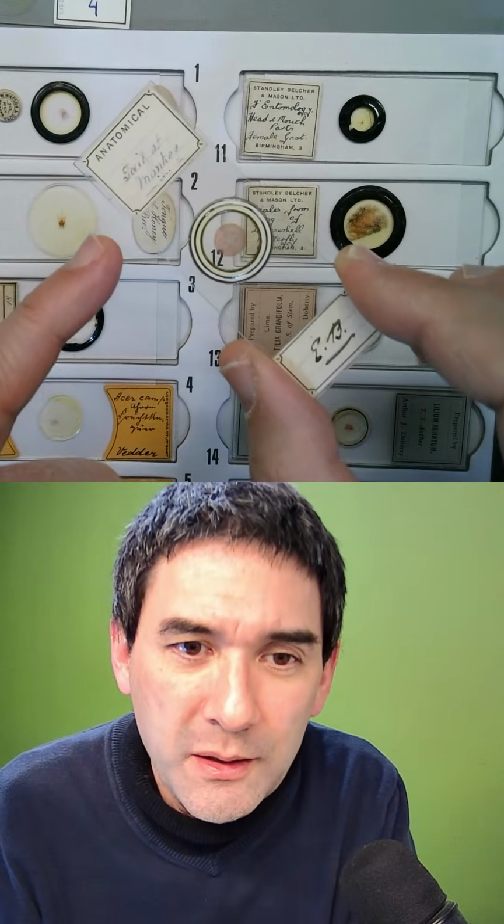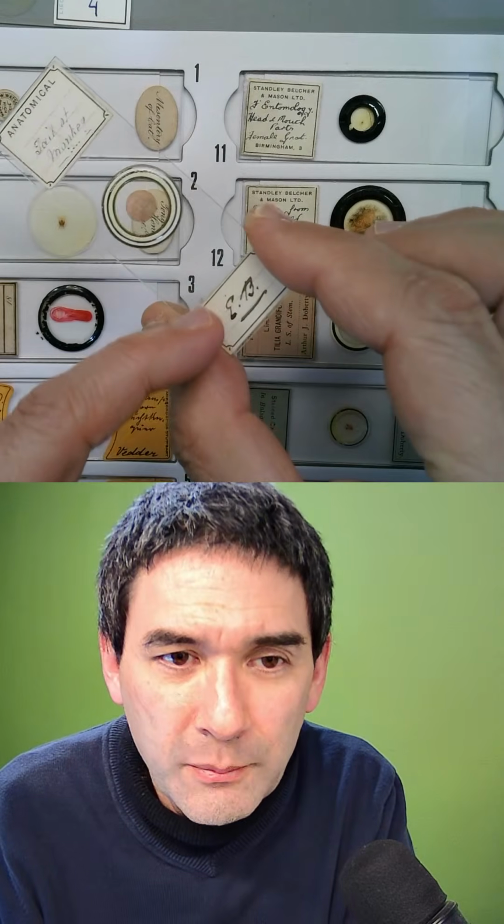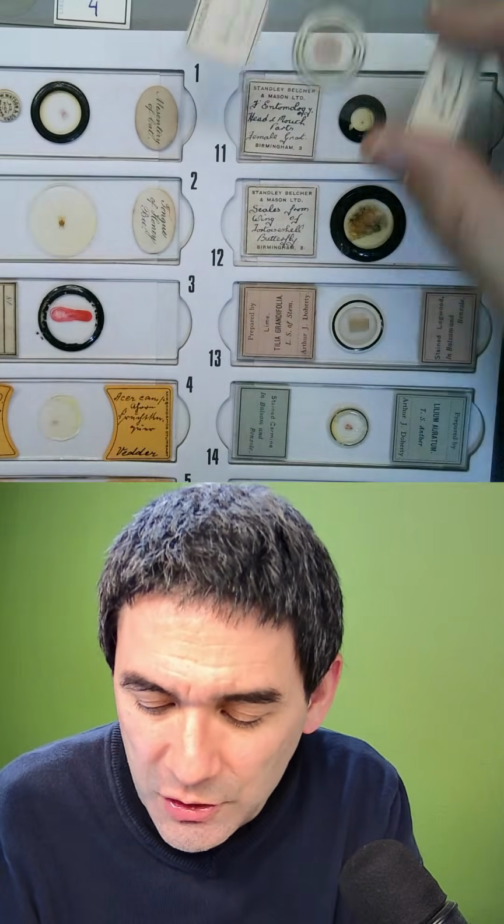It's the tail of a monkey. Unfortunately, I don't know what the numbering down here means. I just want to show you that here.